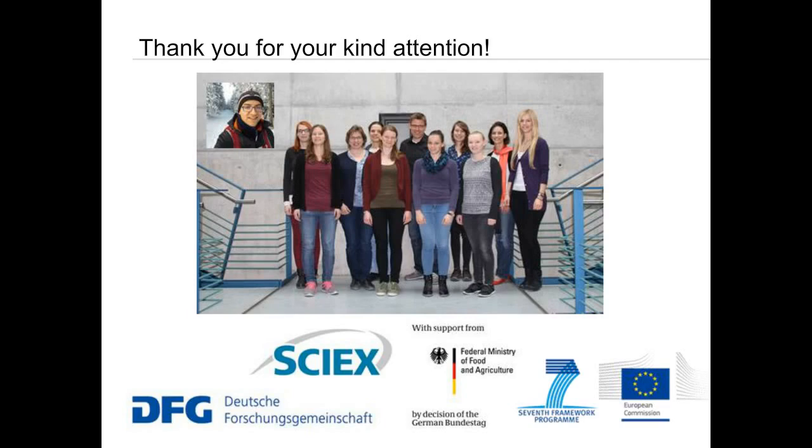Looks like we have time for one more question: the use of animal group specific markers sounds very interesting. Do you think that this can be put into routine testing, maybe authenticity testing? Yeah, I think that this is really possible. We have contact to a number of laboratories which are really interested in implementing authenticity testing in routine. And I do not see any point why this shouldn't be possible.